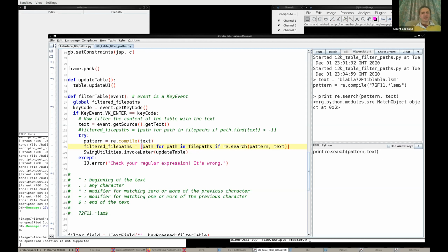Match matches the entire string. And so for that, I would need to add, I believe that wouldn't work. But of course I can try. You see, none. Because for that, the pattern would have to start with the caret, the hat, and then dot star, so that it can match the whole string. I want to search within the string instead.